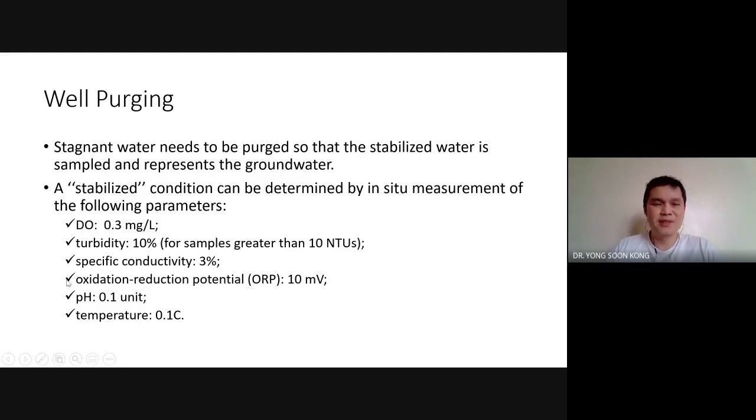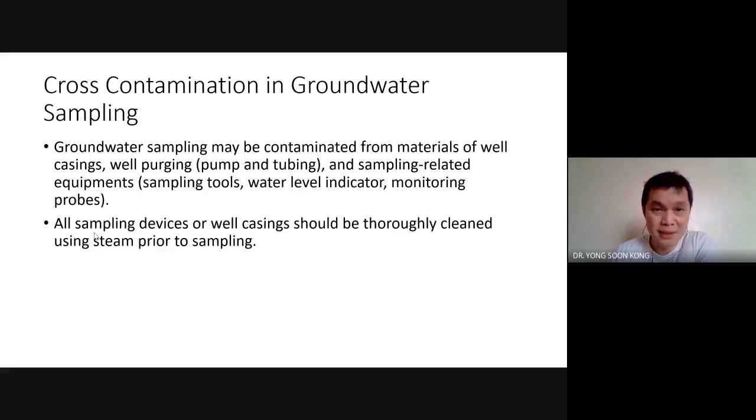Dissolved oxygen actually is very closely related to this one. However, I think the one probe that you possibly can use to identify dissolved oxygen is the YSI array, the one that you use for surface water monitoring. So you can quite safely say that for groundwater sampling, the equipment is more or less the same as surface water, plus you need something extra. What is extra is the pump.